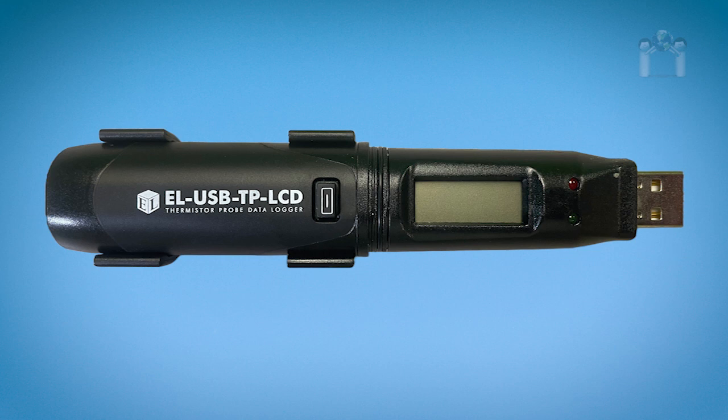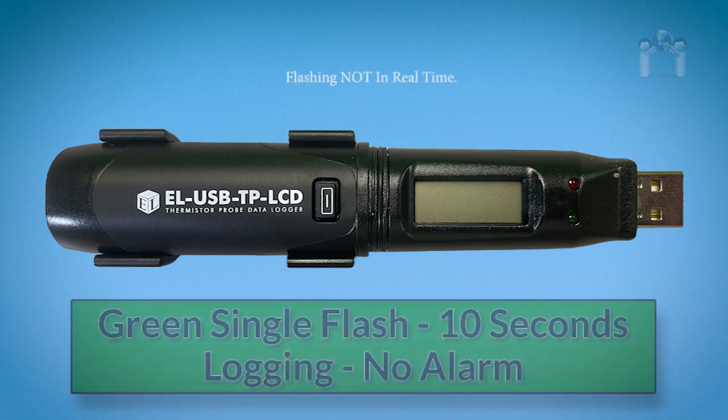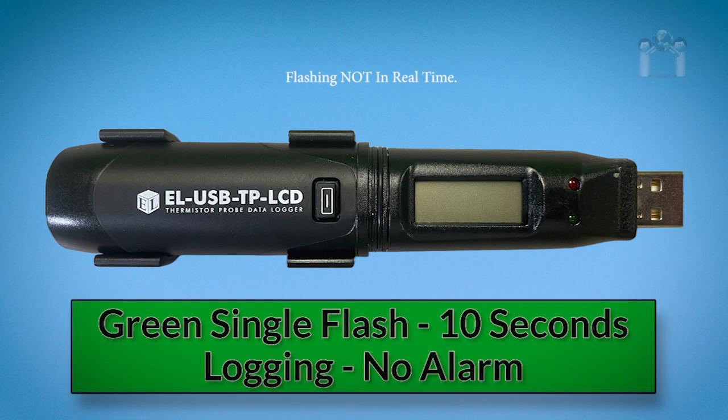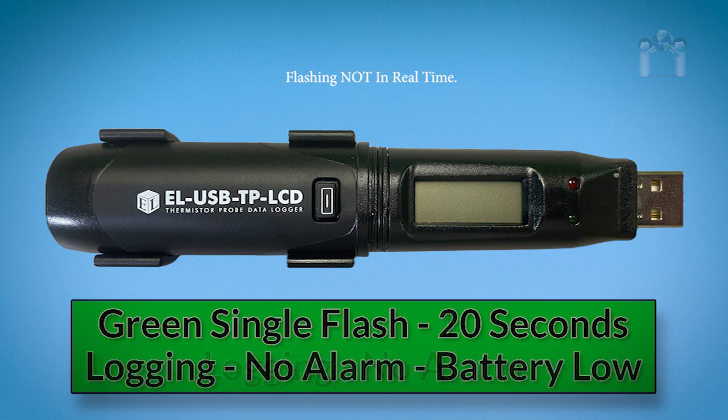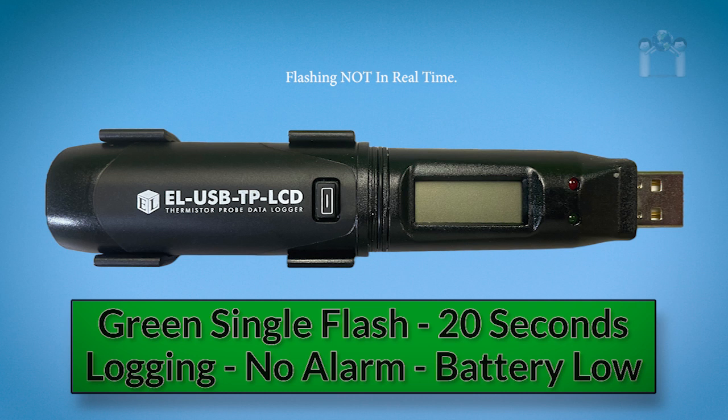Again, you will want to periodically check the thermometer for any alarms. A green single flash every 10 seconds means the data logger is currently logging and there are no alarms. A green single flash every 30 seconds means the data logger is currently logging and there are no alarms but the battery is starting to run low.